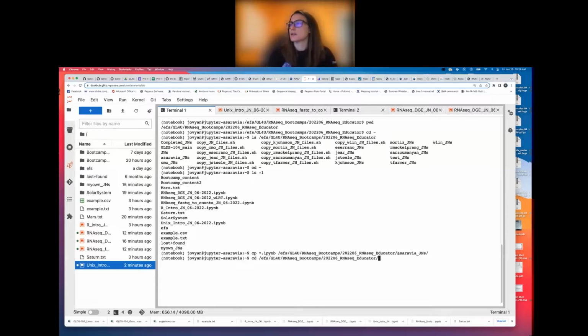So I'll check one of yours. So Chief, I used yours before. I don't know if you're here. So I'll look at yours, or not cd, I'm going to ls. And so Chief has not copied anything yet. So you guys can look and see what's in other people's directories. We all have actually the same username, so make sure that you're not changing things in other people's directories. That's not nice. So don't change anything in anyone else's directories but yours. Unfortunately, there's nothing I can do about that. It's how SMC sets up for groups. So just make sure that you are copying files only into your directory.